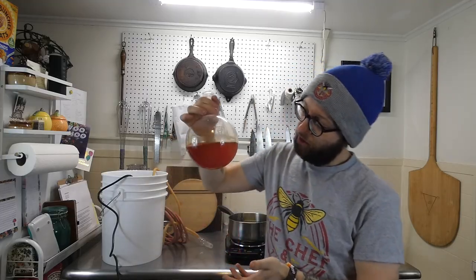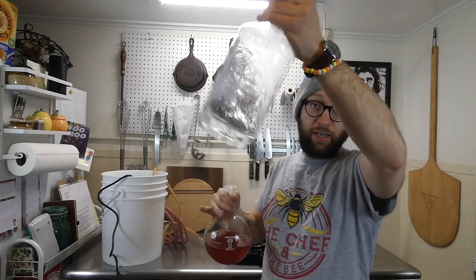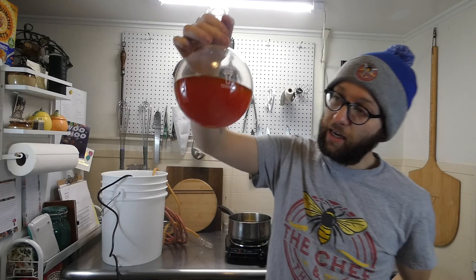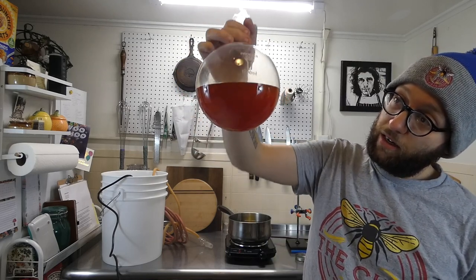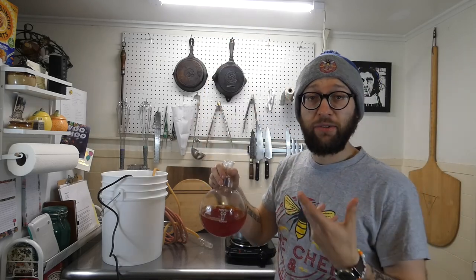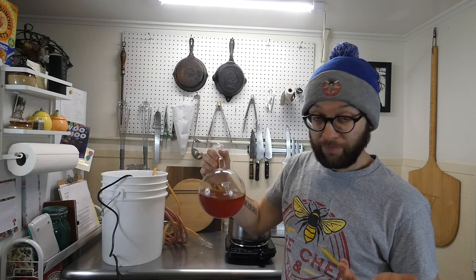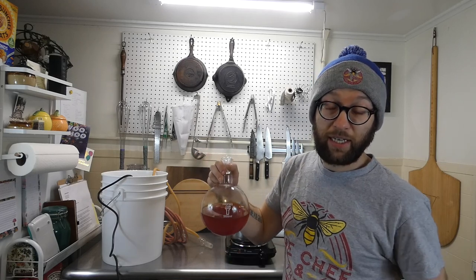All right, so the extraction is complete. As you can see, this was what the ethanol looked like before. And this is what the ethanol looks like after the extraction. It's very red. So the next step is to distill out the ethyl alcohol and be left with the capsaicin.